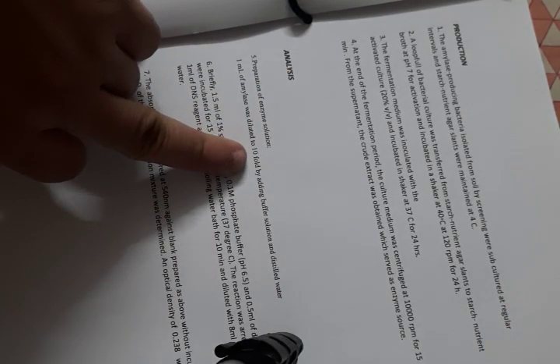And after that, for the purpose of analysis, the amylase is diluted. Here a 10-fold dilution is being shown. Actually, this dilution is done to keep the OD between 0.1 and 1.